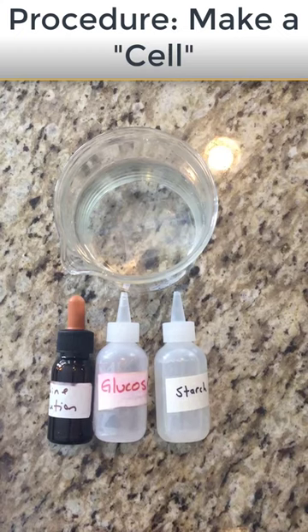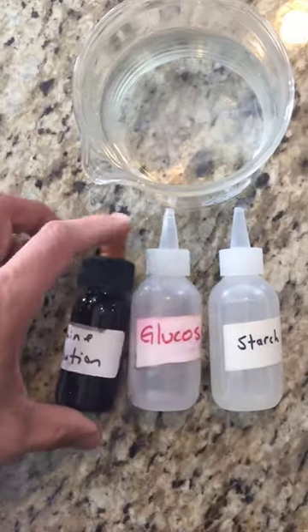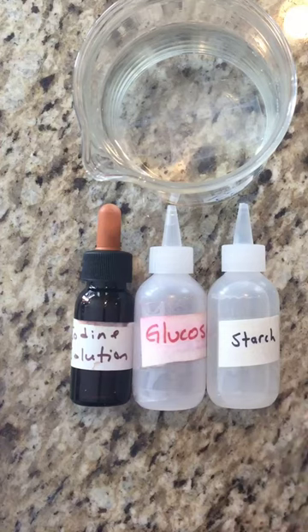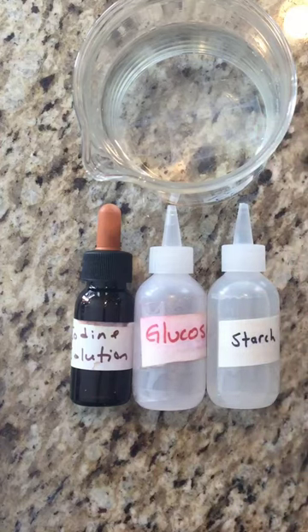This is the procedure on how to make a cell for the diffusion through a membrane New York State Living Environment Lab. The first thing you need to make sure of is that you have your chemicals: iodine solution, which is your starch indicator, glucose solution, and starch solution. You should also have a beaker of regular water and a piece of dialysis tubing.